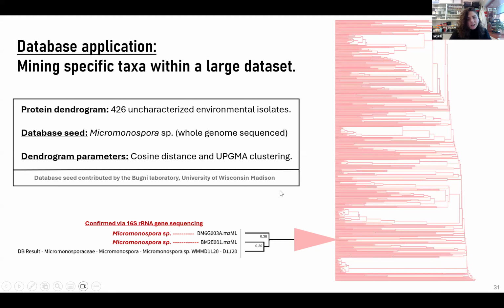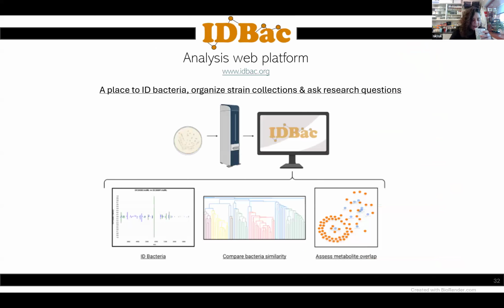And moving from there, I'd like to start highlighting the analysis platform where we created this protein dendrogram. So the analysis web platform, as Dan mentioned, and we talked about the desktop application IDBac that Chase Clark created, we have added components. There are very similar analysis options as the desktop application, but we have added a few more that we are excited to show you.